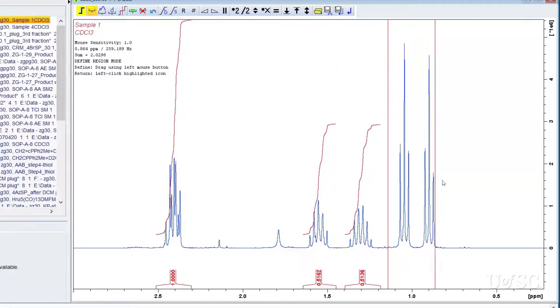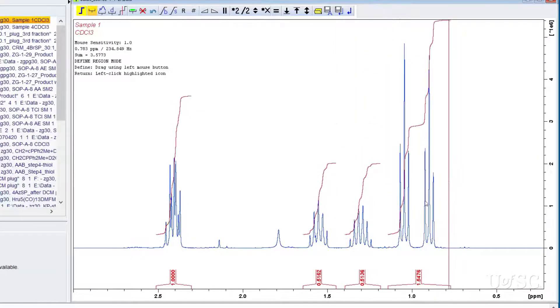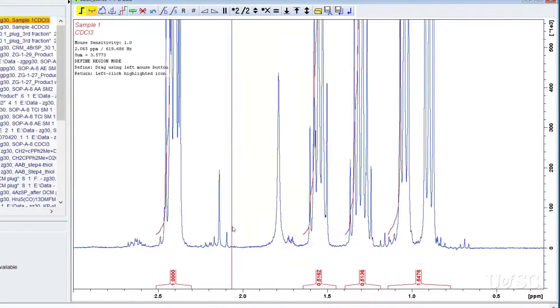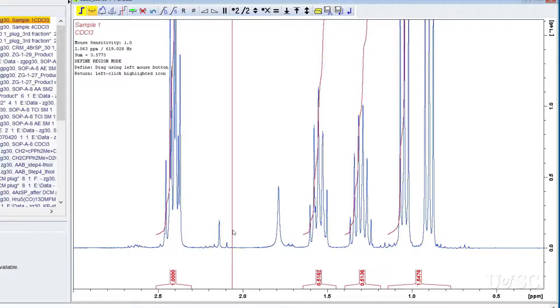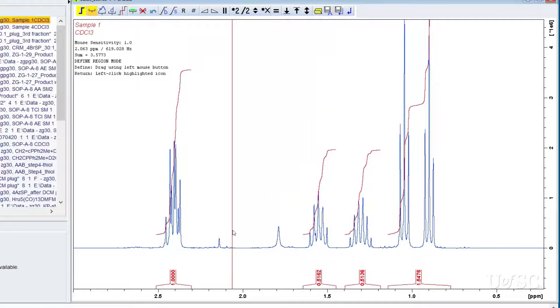You should always leave some baseline on each side of a peak because NMR line shapes are Lorentzian and tail off very gradually. You will lose significant intensity if you cut the region too tightly. For this reason, it is always difficult to integrate peaks that are very close to each other.